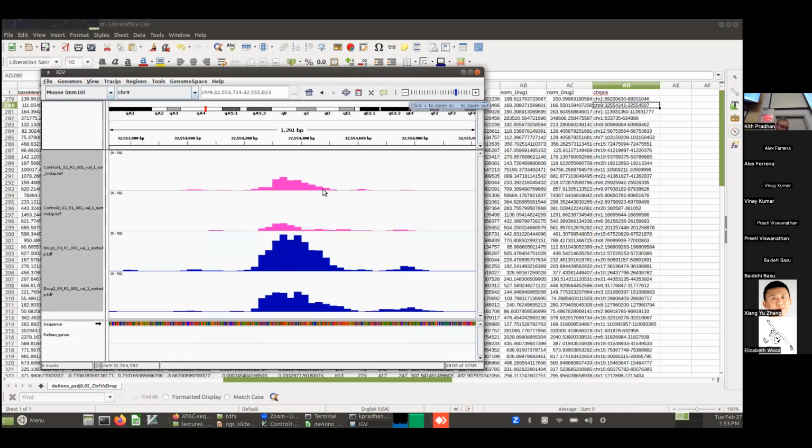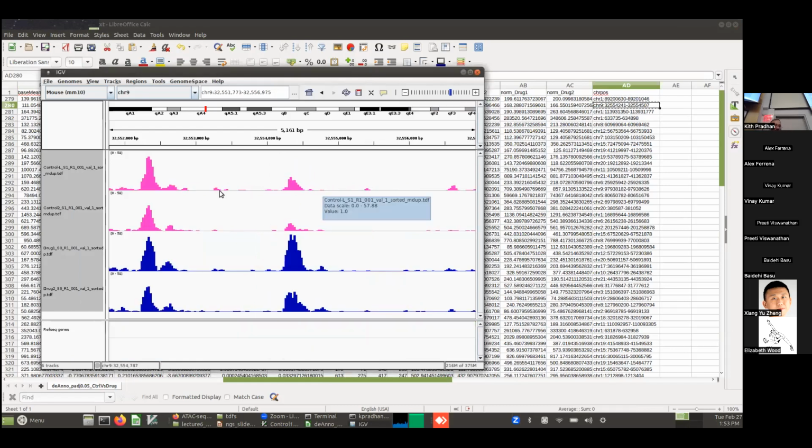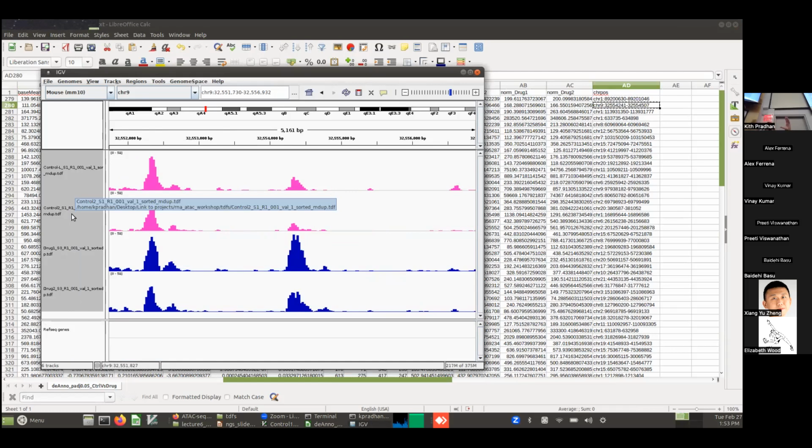By default, if you just set auto range, each sample will be scaled so that the highest peak matches the height of the plot. If you do auto scale first and then set data range, it automatically configures the height so it matches the data that you're working with.